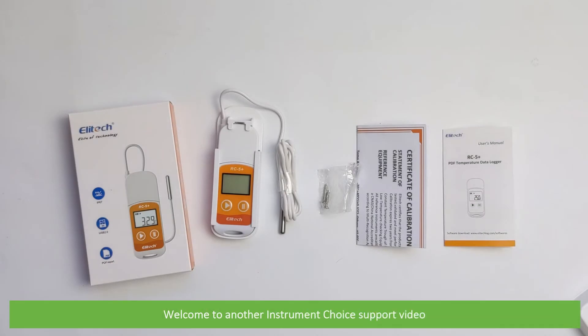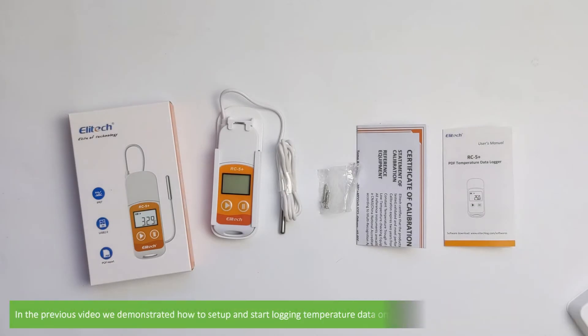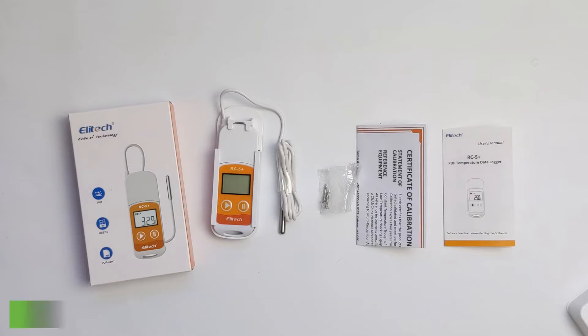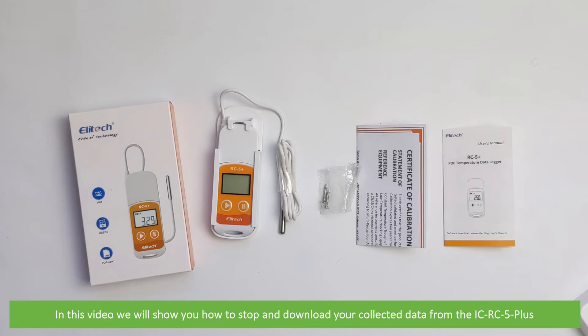Hi and welcome to another Instrument Choice support video. In the previous video we demonstrated how to set up and start logging temperature data on the multi-use USB temperature data logger. In this video we'll show you how to stop and download your collected data from the ICRC5 Plus.